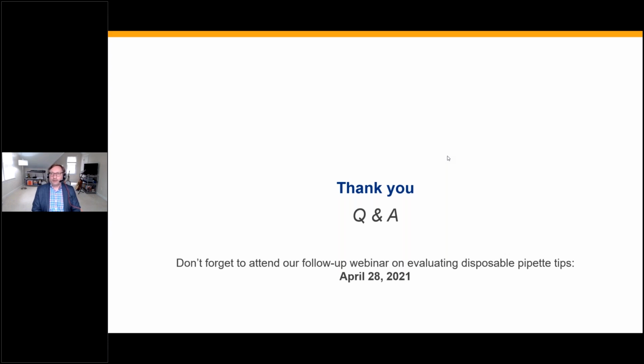I wouldn't, and there's a reason for that. I think all of you can guess. Not only are we trying to be neutral here, but the real reason is it needs to fit your application. This is why you need to test the liquid handlers and make sure that it fits your applications, because we can pick out one that we've seen over time, based on our history and experiences, that performs so great, but it may not meet your needs.